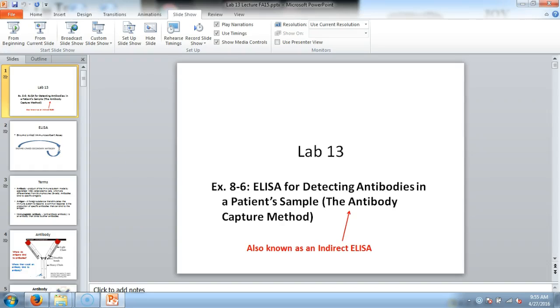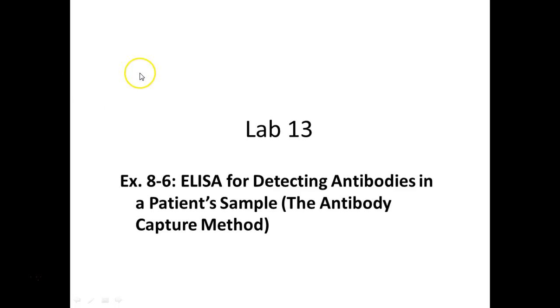In today's lecture, we're doing ELISA, and the one we're doing is actually called the antibody capture method, but most scientists refer to it as the indirect ELISA.